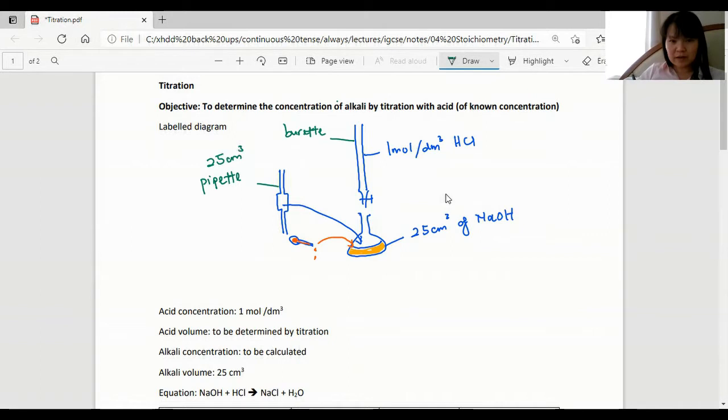This burette is 50 centimeter cubed. This is a conical flask. And this is a dropper, or we can call it a teat pipette.